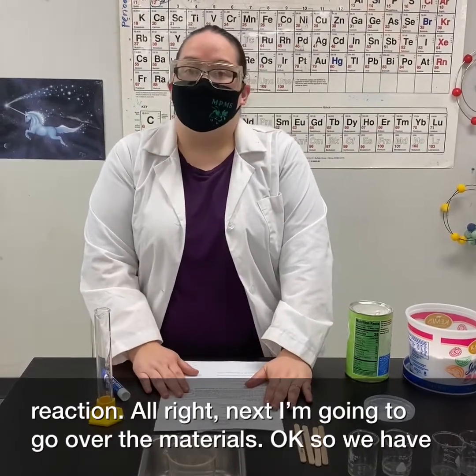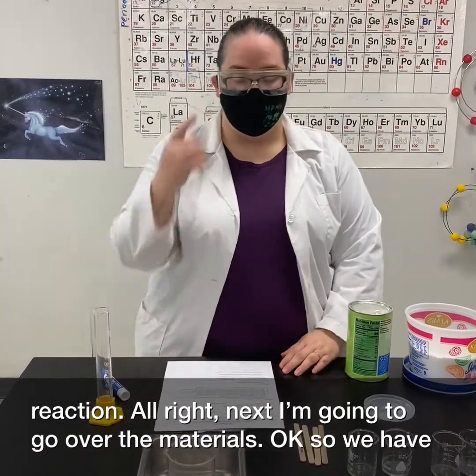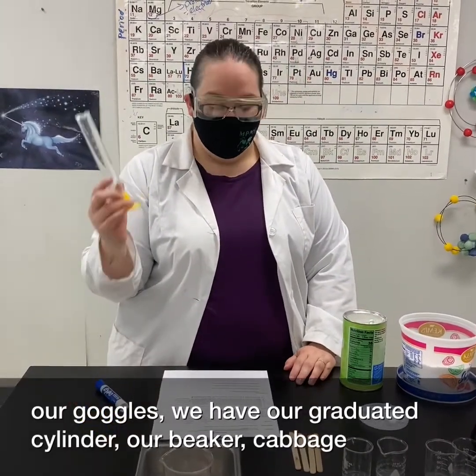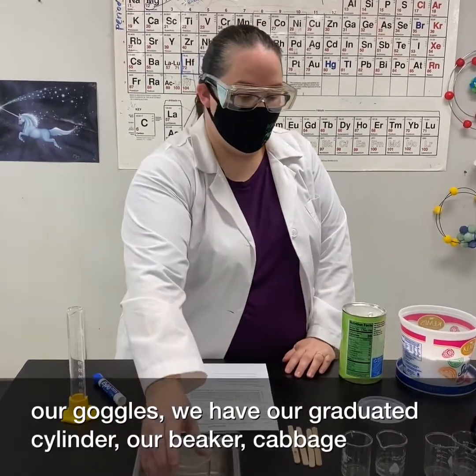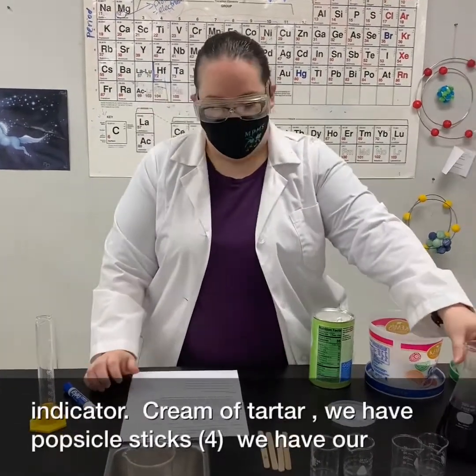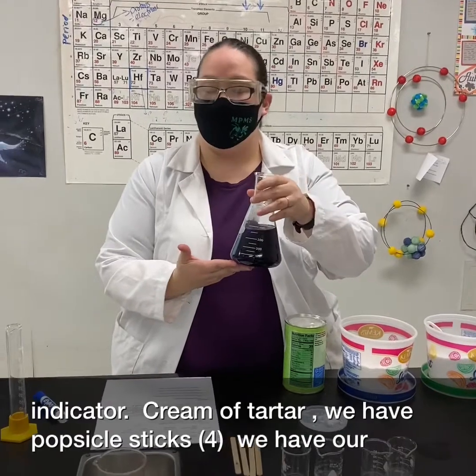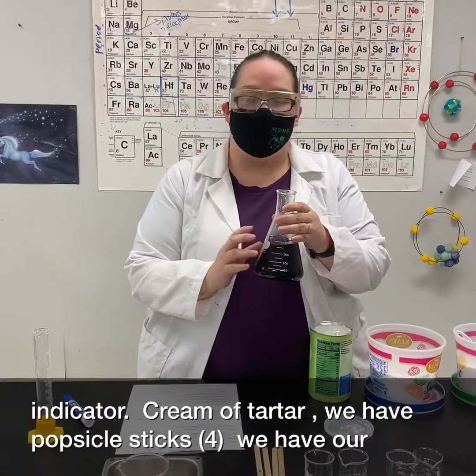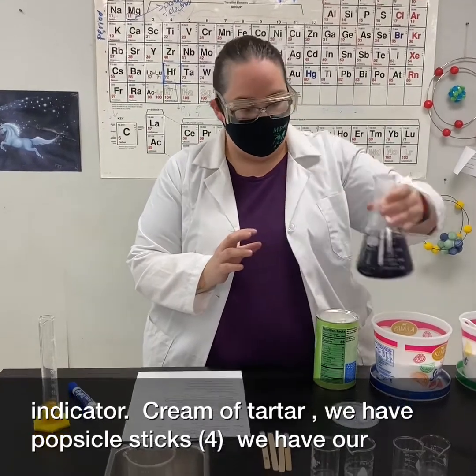All right, next I'm going to go over the materials. We have our goggles, our graduated cylinder, our beaker, and cabbage indicator. The way this was prepped is we boiled hot water and added in the purple cabbage.